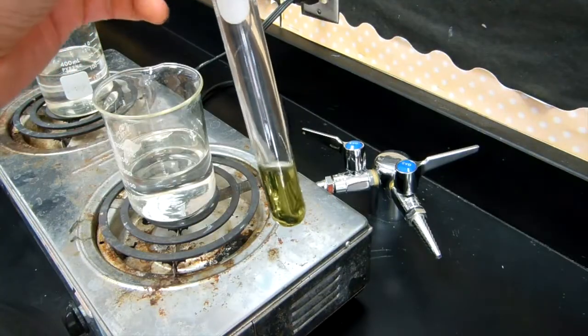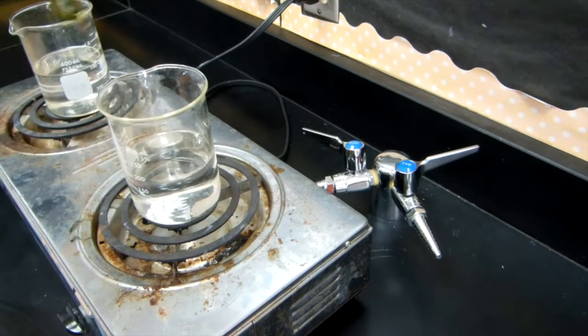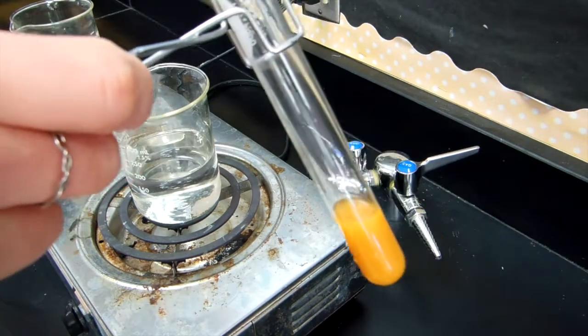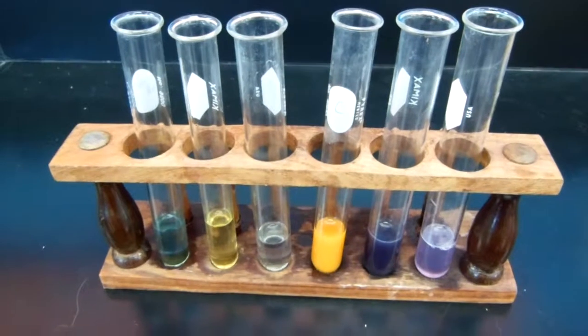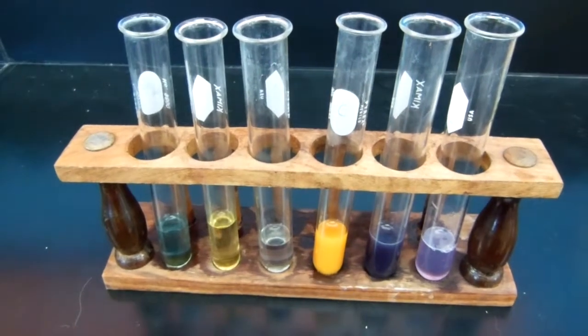For the apple juice, it does need to have water, so I'm just going to go ahead and heat this water and then put it in a water bath and see if it changes color after like 3 to 4 minutes. So now look at the color, and then you can record it in the data table. So then here we have our final results with our control group right here. And then these are the 3 testing ones.